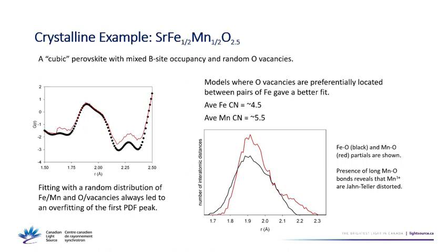So you have a single crystal like you would do for electron diffraction, and then of course if it's a somewhat disordered material, you have diffuse streaks between the peaks in that electron diffraction pattern, and modeling that diffuse scattering in the single crystal electron diffraction pattern, I think is what they're intending to add in with the other types of RMC fitting.